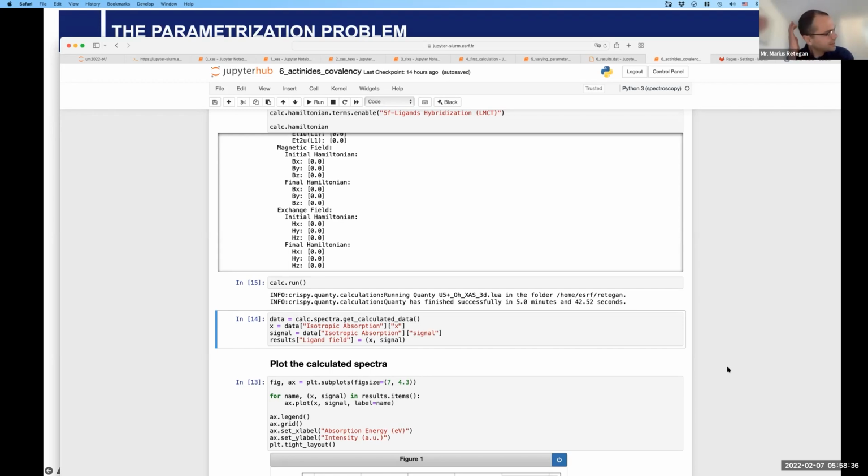And then if you also have 5 different programs or 5 different packages for analyzing the data, of course, if you do RIXS and you do quick EXAFS and you do EXAFS and whatever, then of course you need a different program. But it would be nice to have one program like it was in Athena.